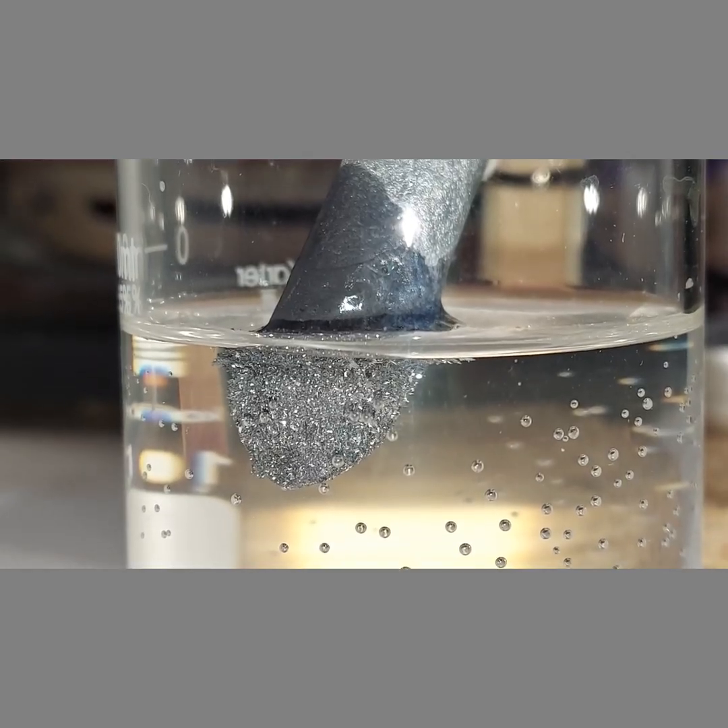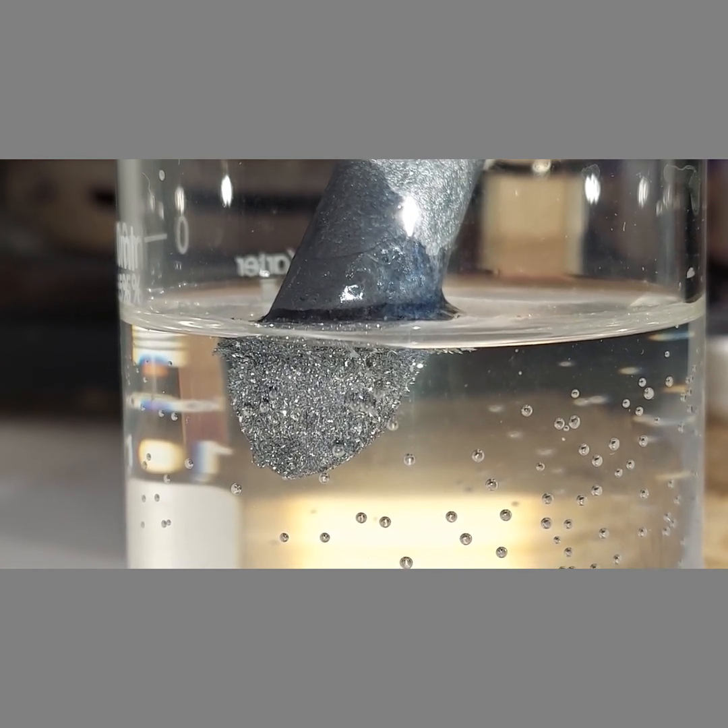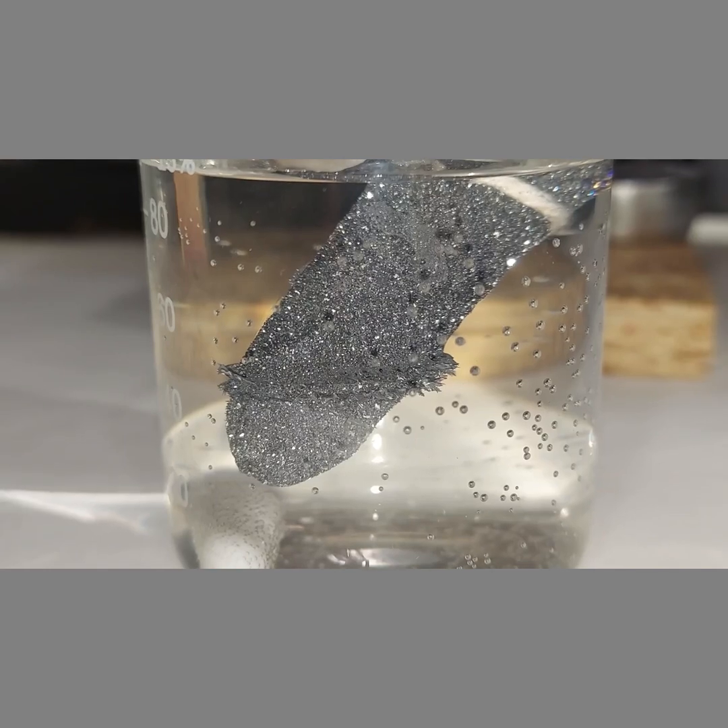Although there are lead crystals there, the growth has slowed down a lot and I'm thinking I'm going to dunk the entire zinc rod into the solution. I put the whole thing in there now.